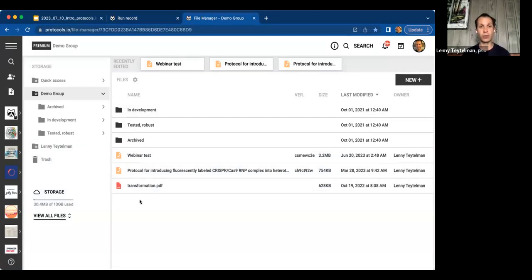And if you're using protocols.io for internal development and organization with your collaborators or teams, this is where you create a workspace. An administrator can invite members and everyone is on the same page, using the same space to share the protocols across the company, across the organization, or within a team. A typical workspace might be 5 to 10 people. We also have workspaces with hundreds of people in them. So there are consortiums, collaborative groups working all across the globe, and they use protocols.io to communicate and collaborate with each other. Not as a lab notebook where they're sharing all of the pages, but specifically for organizing and collaboratively doing method development.